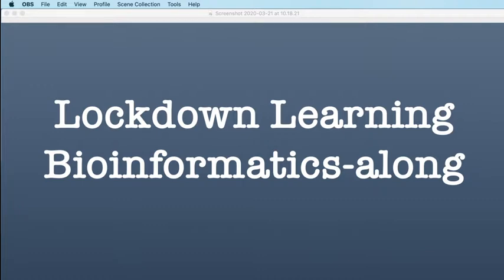Right, so yesterday we started to think about how to install software. That was the goal for this week: to build ourselves a script which can download some data and build us a multiple alignment from the protein sequences that we download. So in order to do that, we needed some software that enables us to build that multiple alignment. And that's what we spent yesterday doing.